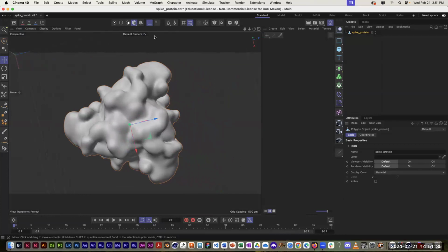Right, so before I forget, now I'm going to turn off that enable axis tool up here. I'm going to just click again on that thing that looks like an XY axis to make sure that I don't inadvertently pick up my axis and move it again. All right.